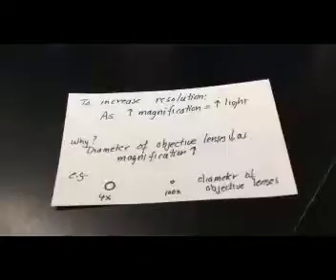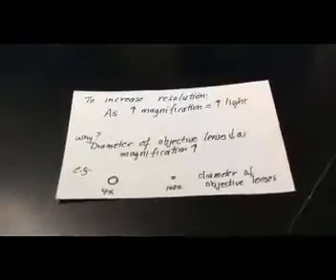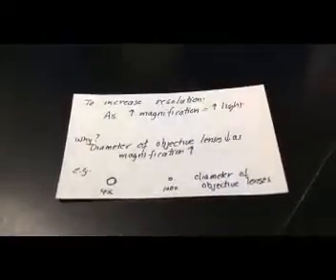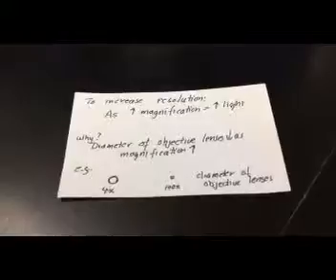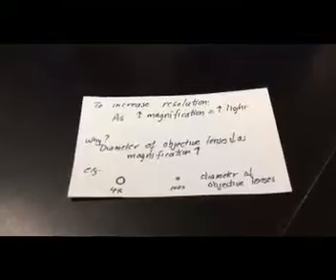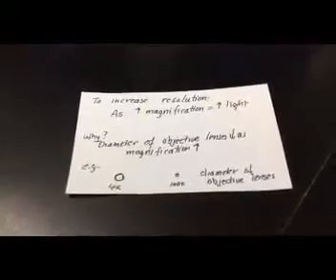So to compensate, as we start looking at our specimen using the scanning lens, we'll have our rheostat, our variable light control, at a moderate setting, say maybe 5 out of 10. And then as we move up to higher and higher objective lenses, we're gradually going to increase the setting of our rheostat. So by the time we're working with an oil immersion lens, we will have our rheostat maybe on the highest settings, maybe settings 9 or 10. And again, that's going to help increase resolution.